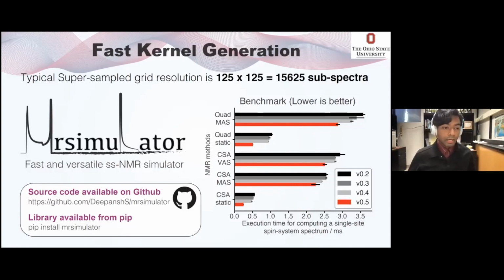So what we are choosing is a regularization that is consistent with what is publicly believed to be a likelihood for a probability distribution. For one, it's smooth, so you can't have arbitrary spikes in the probability distribution.